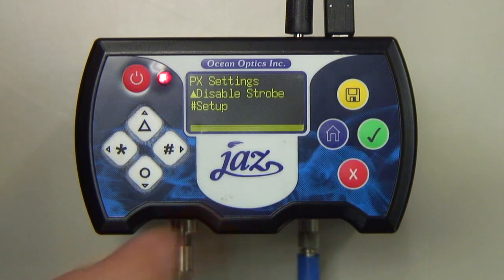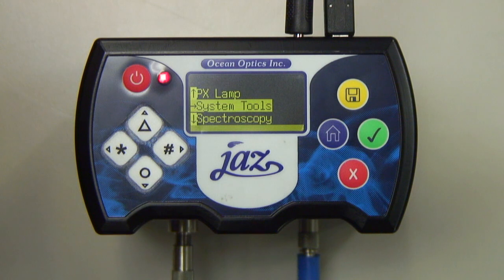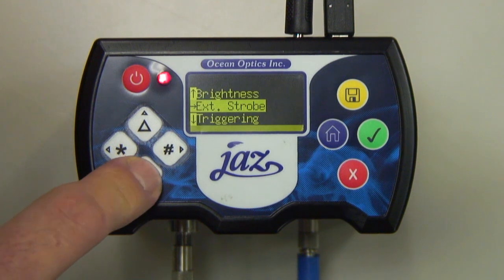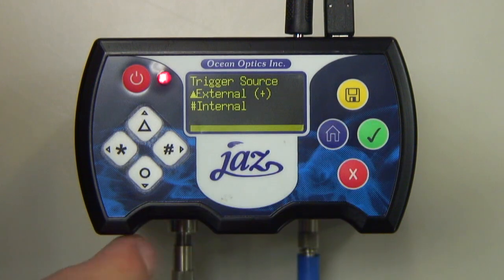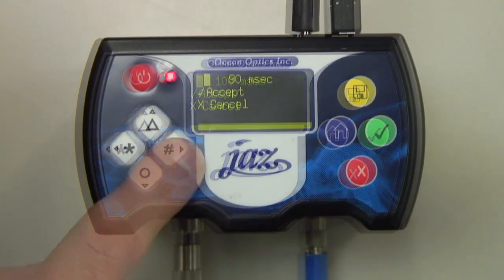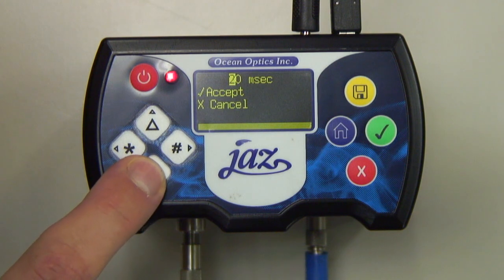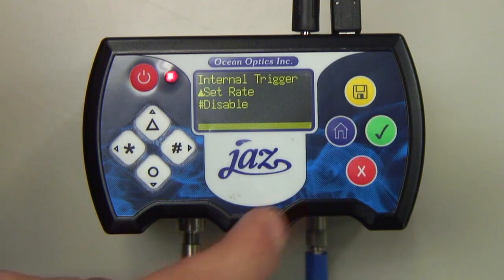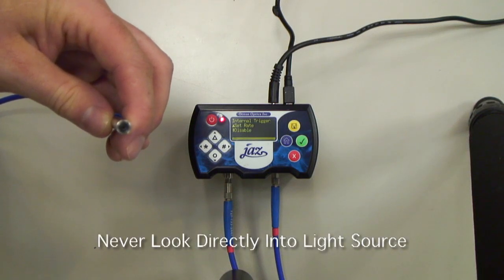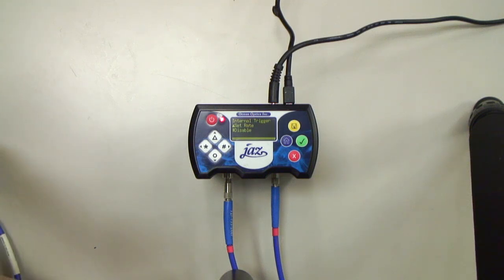To enter Triggered Mode, navigate to the PX Lamp menu and enable the strobe. Return to the System Tools and select Triggering. Clicking the Pound button selects Internal Triggering. Now press the Triangle button to set the rate — in this video, we have chosen a rate of 100 Hz. We have connected an R400 reflection probe to the Jazz PX, and you can see that the lamp has started to pulse. Remember, the PX produces ultraviolet radiation that can cause permanent eye damage. Always wear safety eyewear during operation and never look directly into the light source.